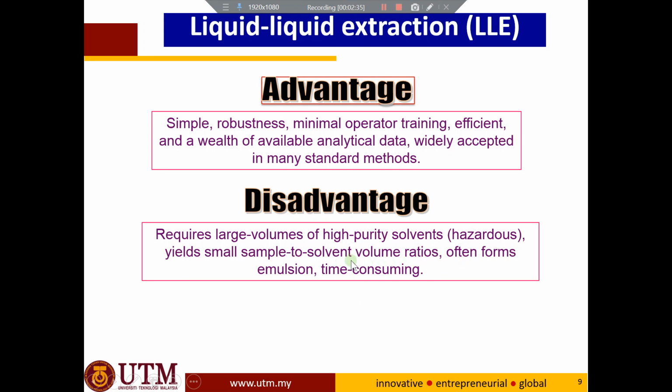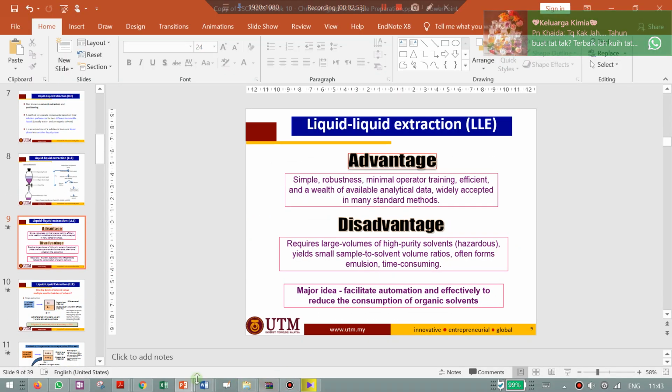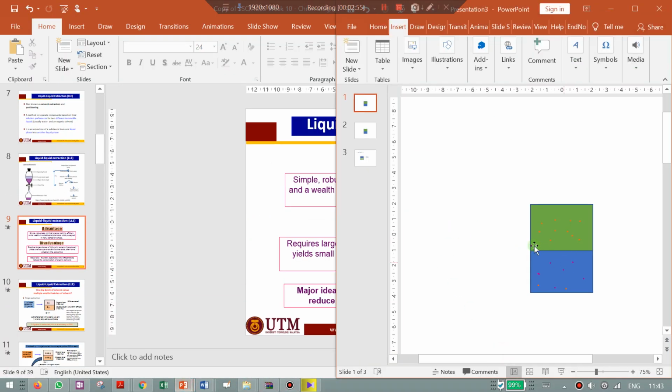Okay, the next one is time consuming, because it may take some time to release the pressure gas. It will take some time before the two layers become totally immiscible. Because sometimes you have already mixed everything, you shake everything, and it will take some time before the two layers become totally immiscible. It will take some time.